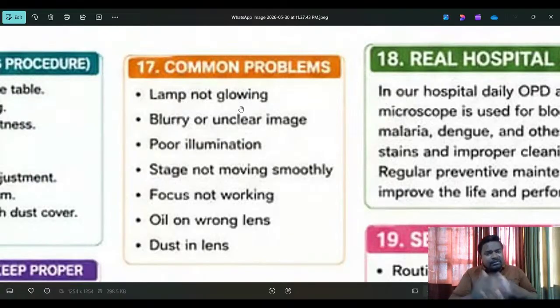That's why, whenever possible, try to engage with the hospital management, and at the same time try to give explanation and user training. Understand? This is a minor equipment. I know because I am an experienced person, so I take it easily. But for newcomers it is very, very important and also a very challenging task.